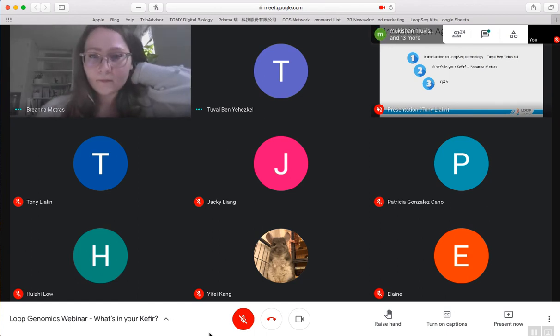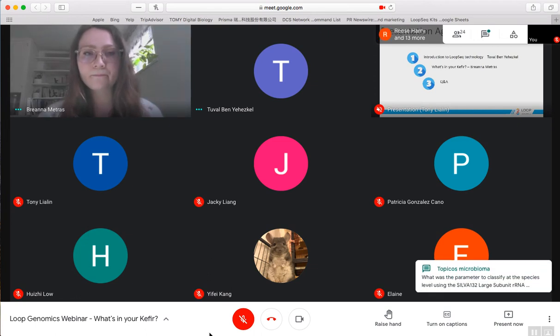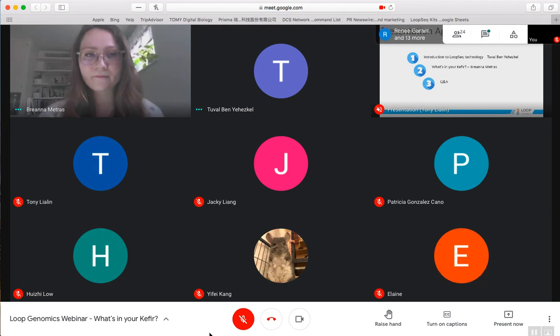Got it. Great. And then how many sequencing reads were used per sample? We talked about this. I believe there was around 30,000 molecules per sample. Yeah, that's exactly correct. There was anywhere between 10 and 30,000. And one thing that's important to mention here, from a technology point of view, is that is the number of long reads that were used. So roughly between 10 and 30,000 individual full-length 16S molecules per sample. But the number of short reads that were used to make those tens of thousands of long reads is in the low millions. So anywhere between 4 and 6 million short reads per sample is the number of molecules that were sequenced per sample.